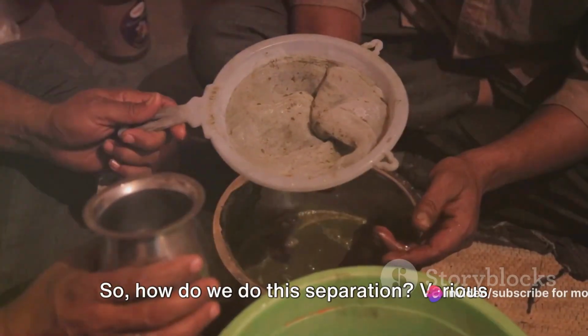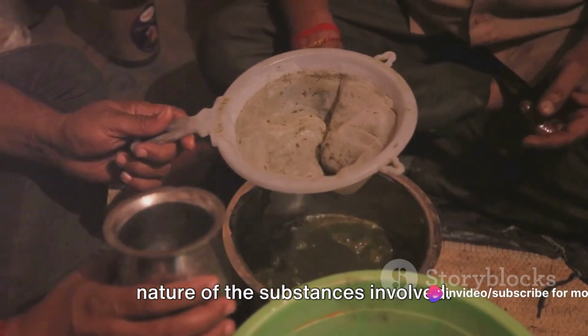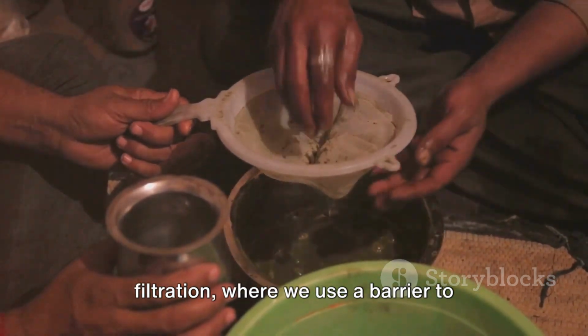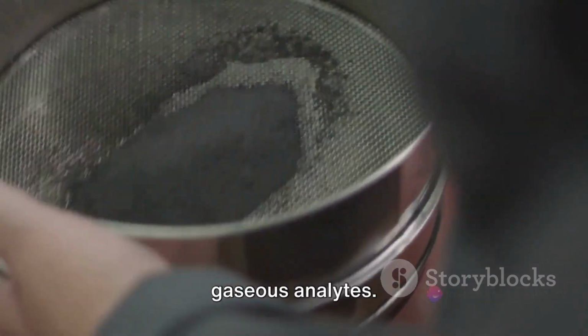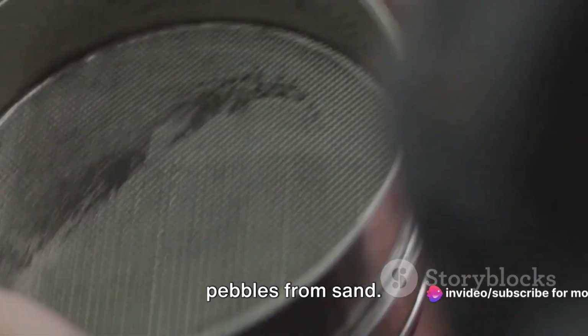So how do we do this separation? Various techniques come into play depending on the nature of the substances involved. One of the most common methods is filtration, where we use a barrier to separate solid interferents from liquid or gaseous analytes. It's like using a sieve to separate pebbles from sand.